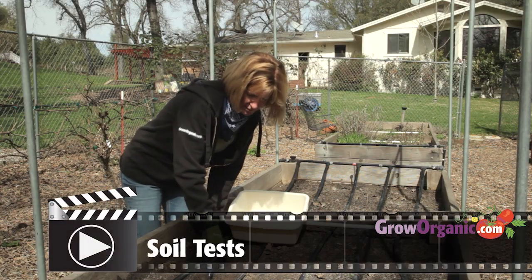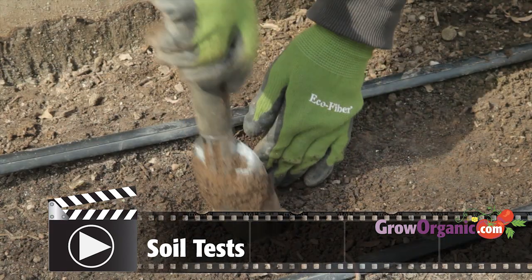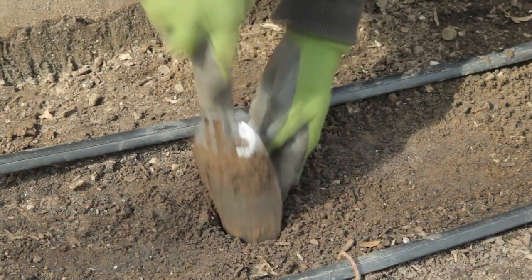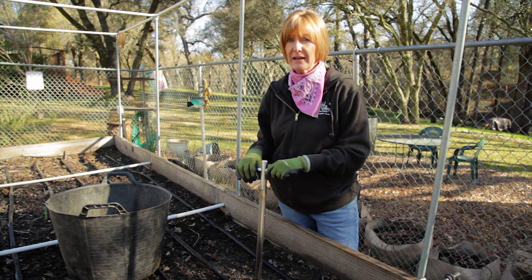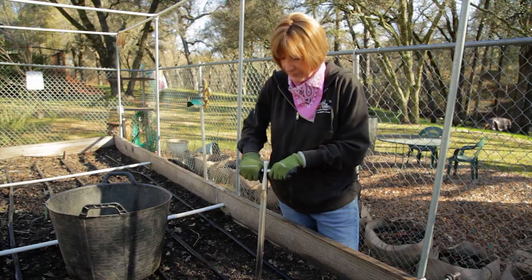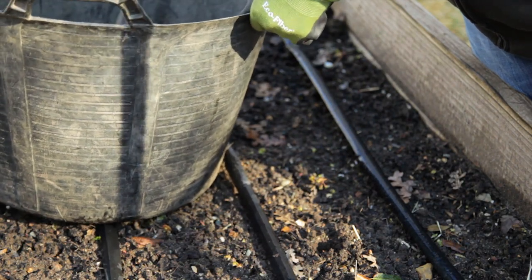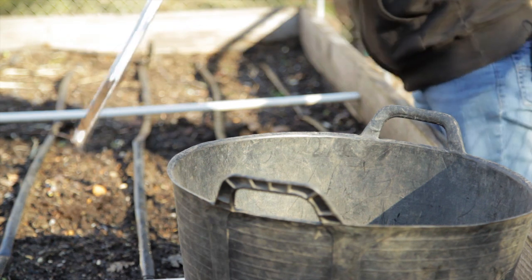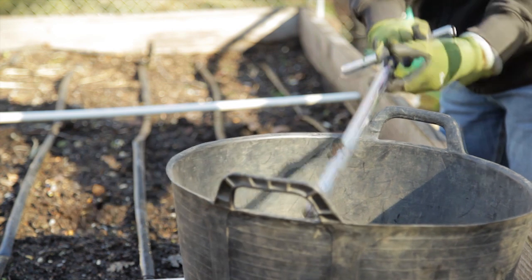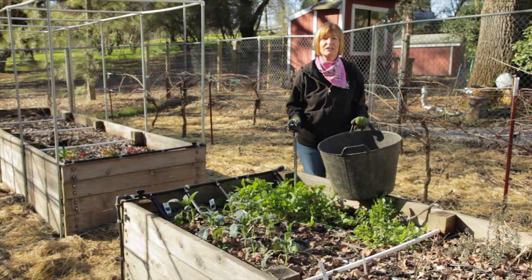For more information on taking a good soil sample and the type of testing a laboratory performs, check out our soil test video. Take several samples from a single area and go down about 6 to 8 inches in depth. Then mix the samples together. Avoid touching the soil with your bare hands. Put the soil in a clean plastic, stainless steel, or paper container. Do a soil test for each distinct area in your garden.